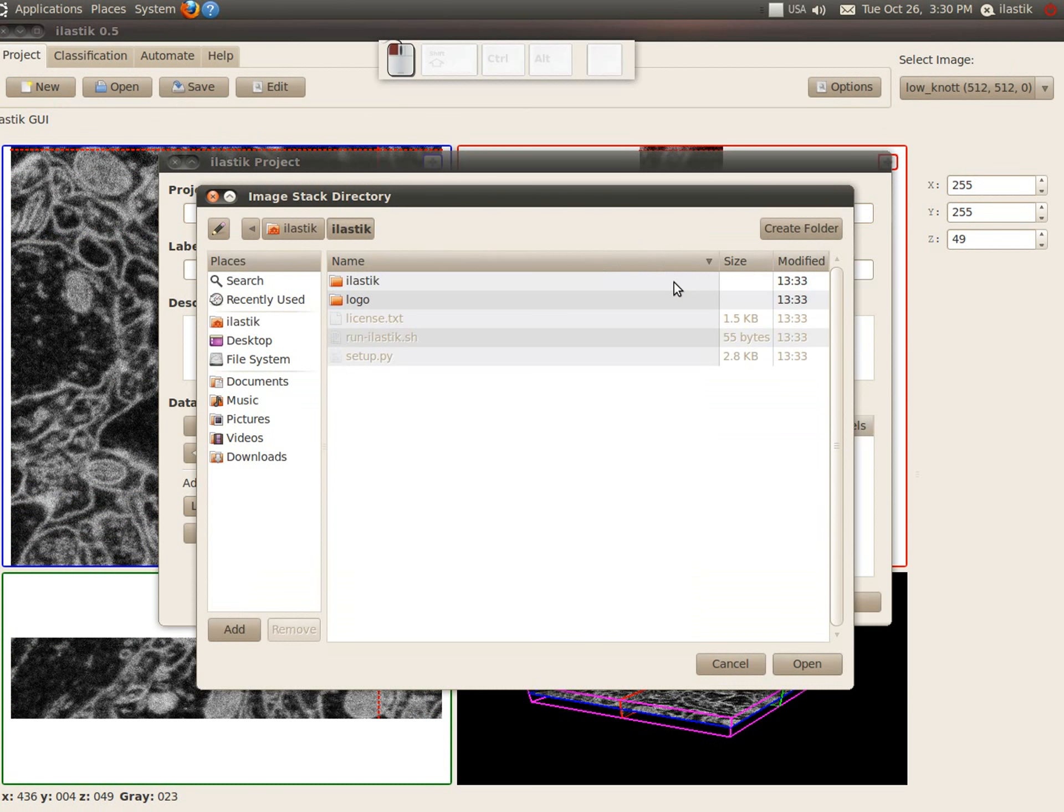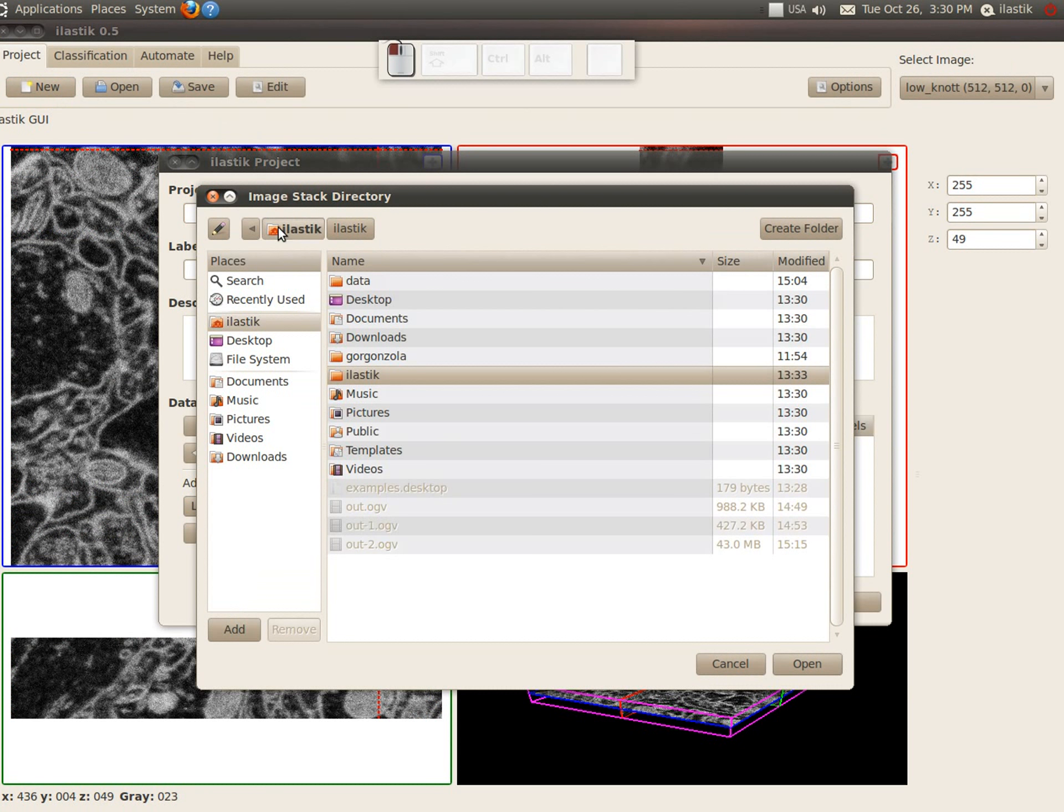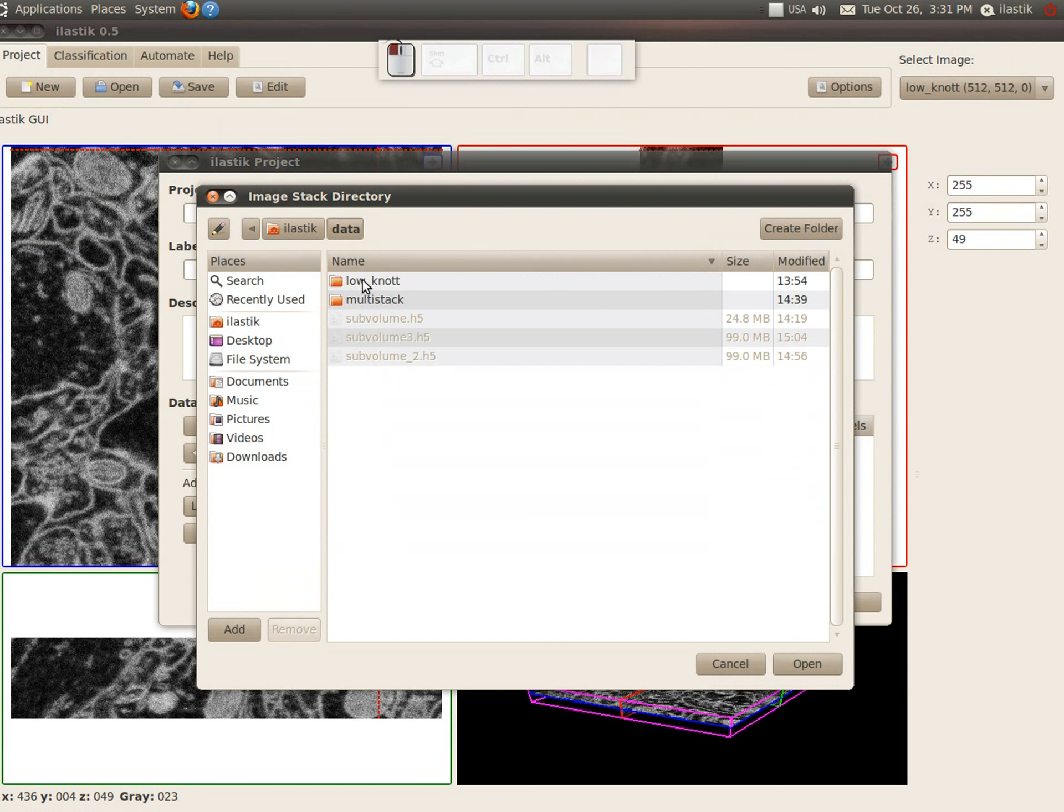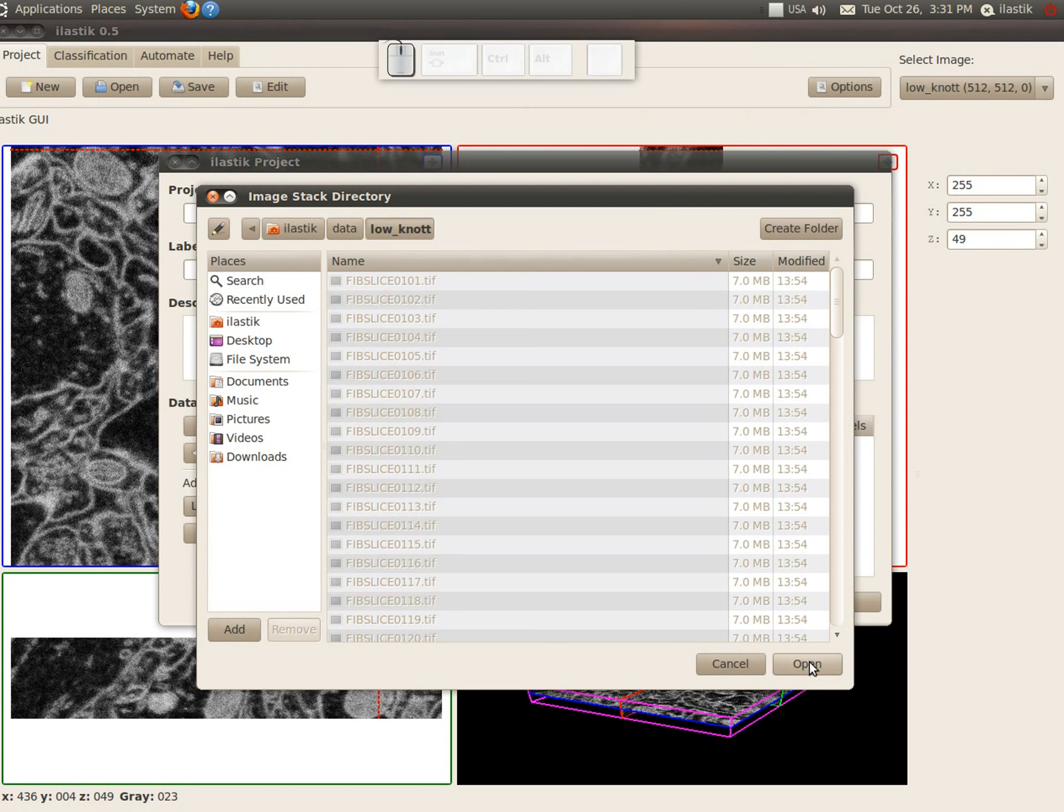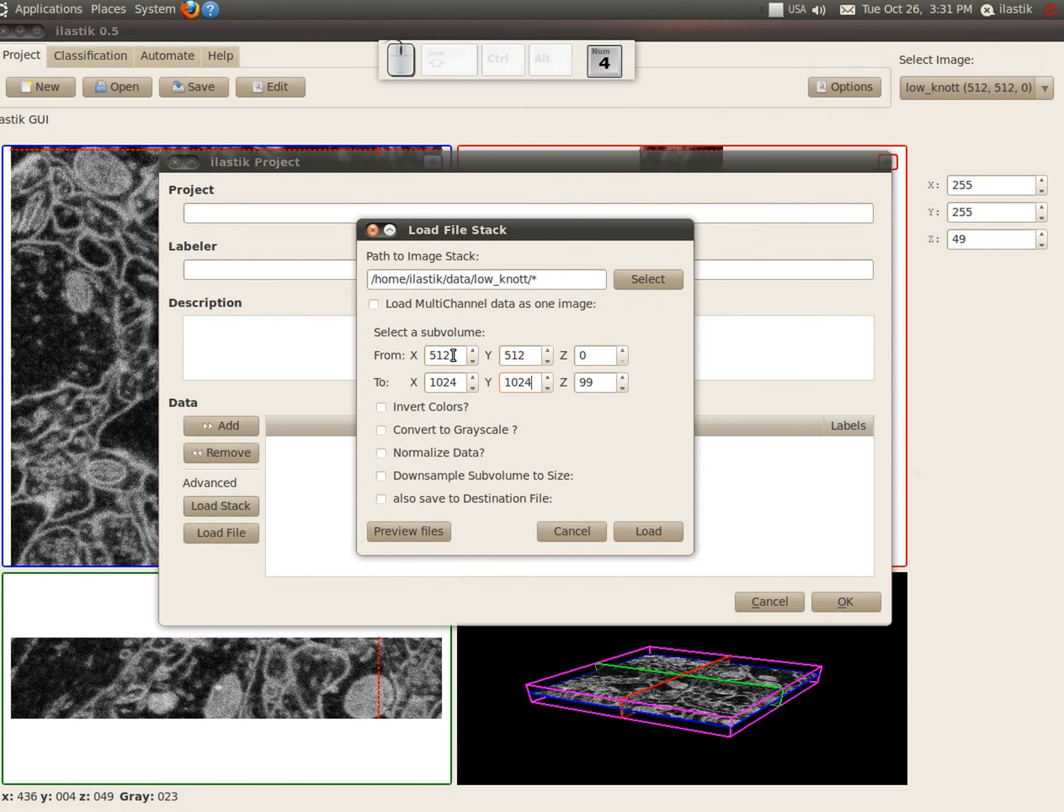So let's select the same stack again and select the same subvolume again and then invert the colors.